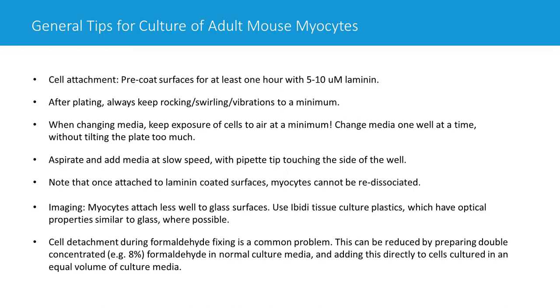Once cells are attached, it's really not easy to detach them and keep them alive. Some people plan to culture cells for 48 hours and then detach them for assays like functional measurements. I can't recommend this — whatever you use, whether trypsin, accutase, or other methods, you will tend to kill most of your cells before they actually detach. Once they're stuck down, it's best to leave them stuck down.